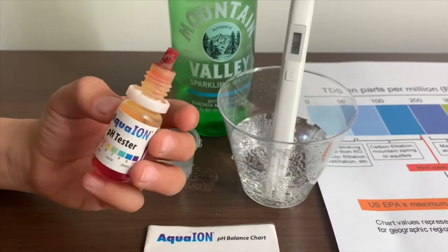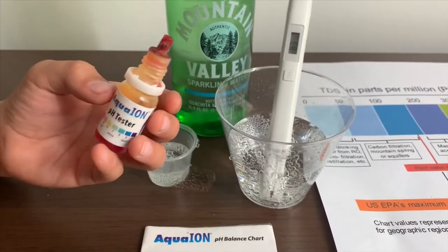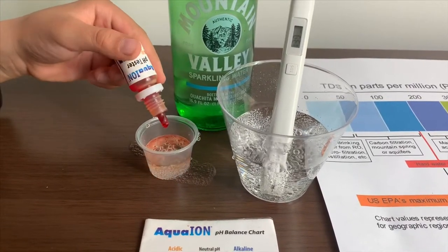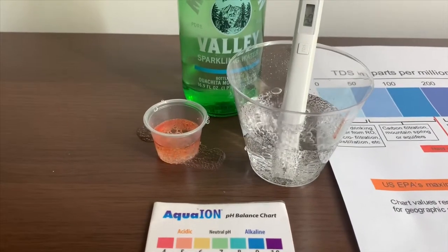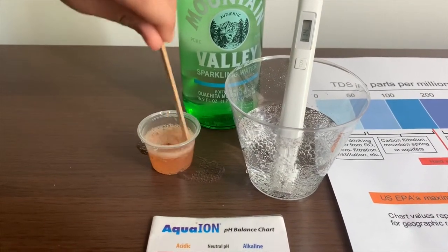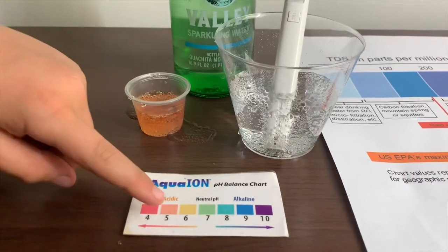If you want to buy this pH tester, check the link down below. Only do two drops. Let's stir it a little for a better result. And give this a 5 — this is acidic.